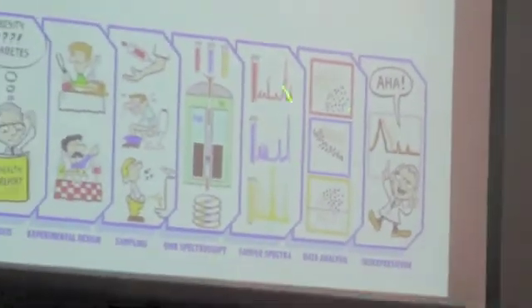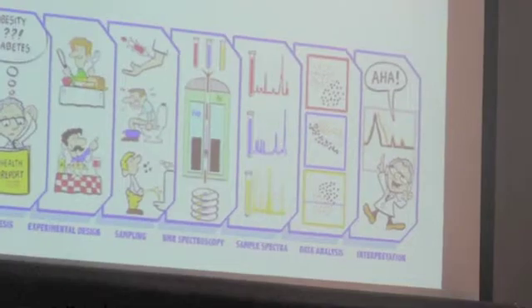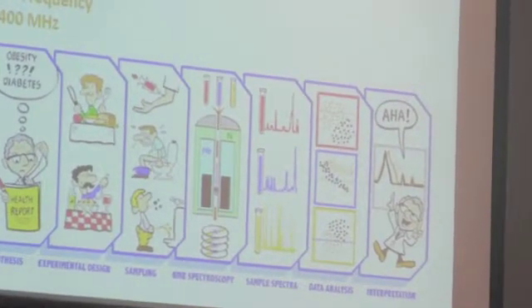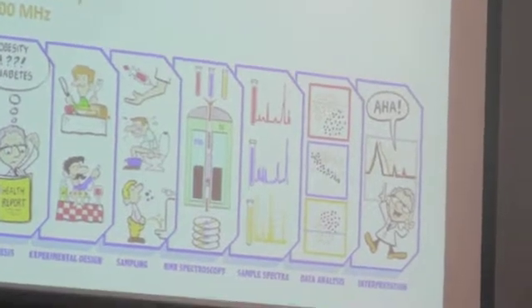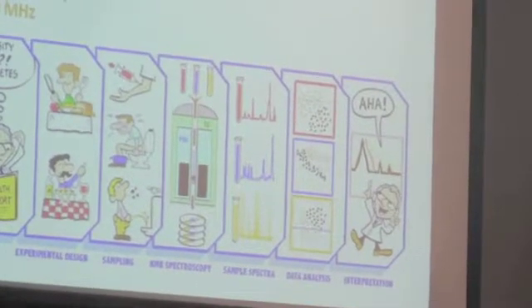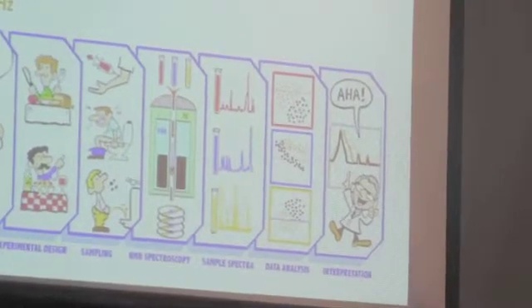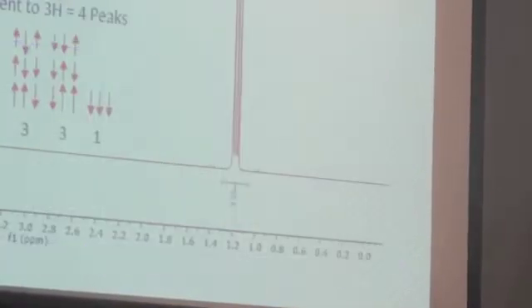And this metabolite aspect of it is very similar to what you're looking at in a beer or a cider or a wine. You're looking at the metabolites of the yeast. So you get this kind of complex spectrum that has ethanol and all these other things in it. And you can see all the other little molecules that the yeast produced as well.